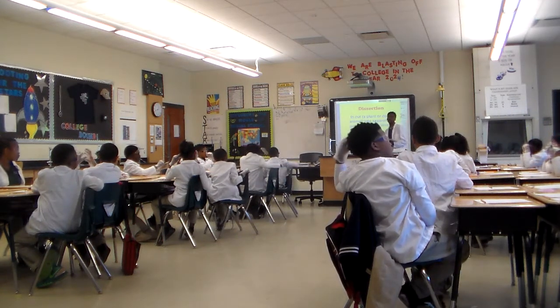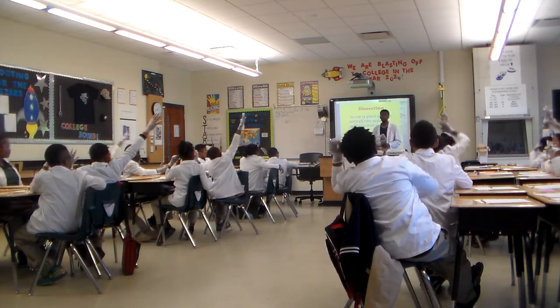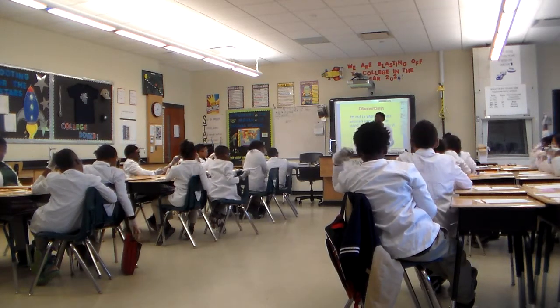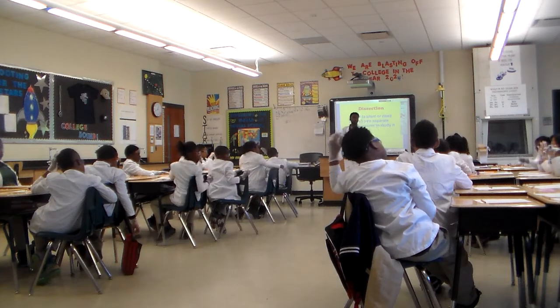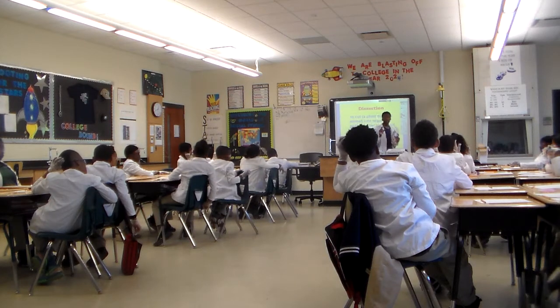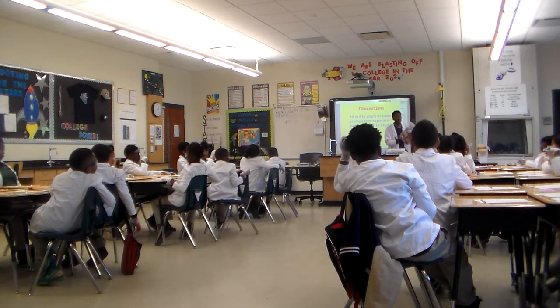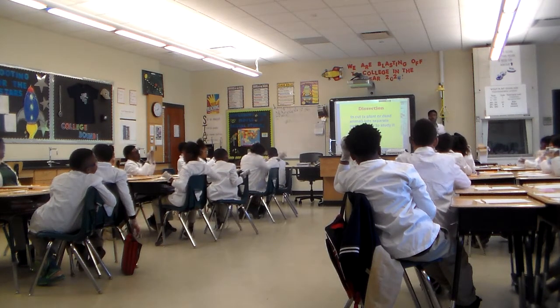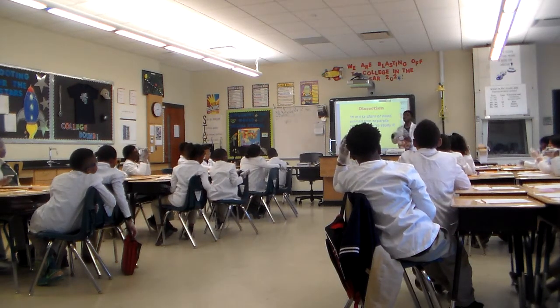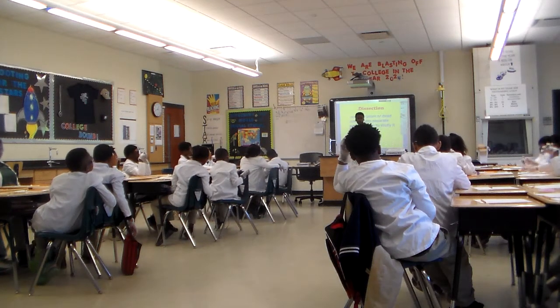There's one word in this definition that I want you guys to focus on really, really heavily. What do you think that word might be? Yes. To study. Exactly, right? Instead of us learning about the human heart from a book, I thought it would be a good idea for you guys to get a specimen right in front of you, right? A sheep's heart, right? So with that being said, we're not just cutting things open just to cut them, right? We're cutting them open in order to examine them further and to study them. Is that understood?